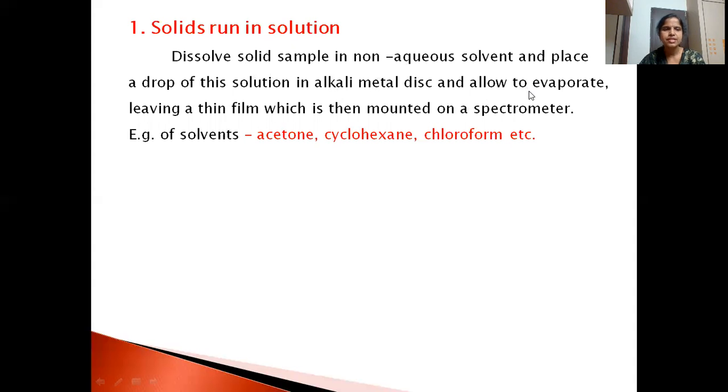The solvent will evaporate. Then that film is taken and mounted on a spectrometer. The solvents we generally use for this are acetone, cyclohexane, and chloroform, all of which can be evaporated very easily.